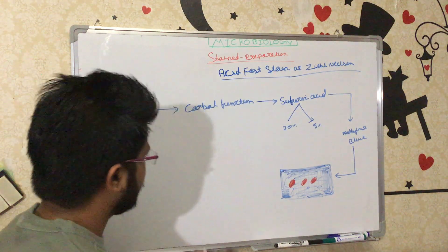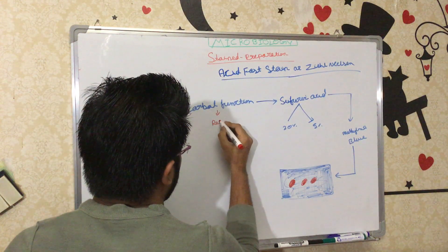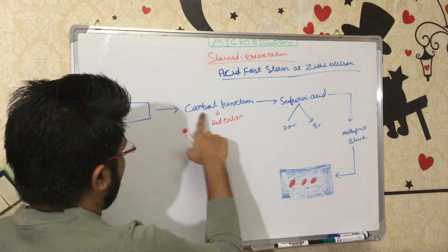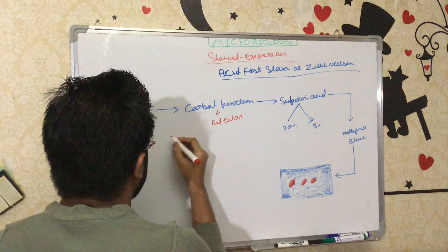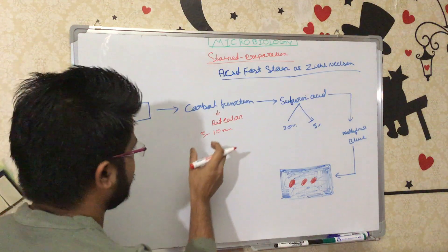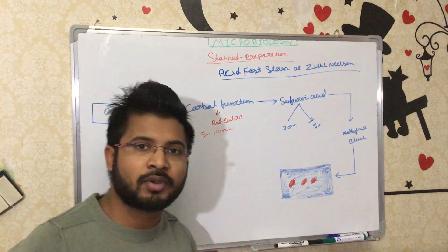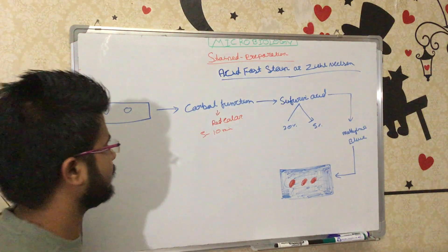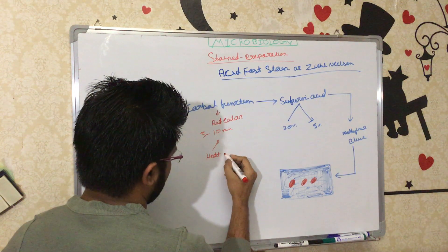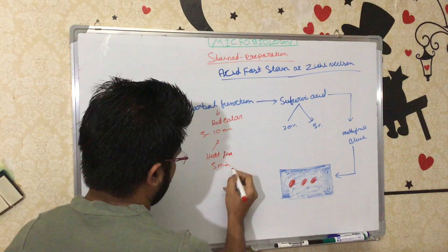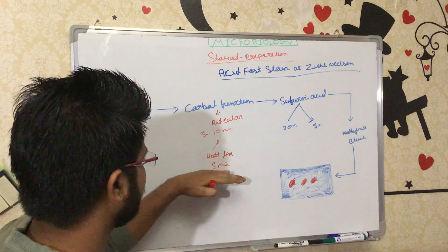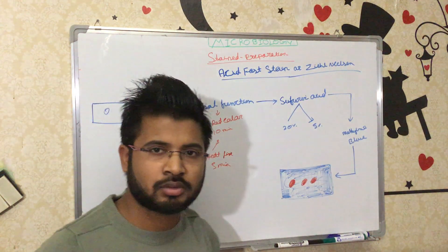After heat fixation, we apply carbol fuchsin — which is a red color dye — on the slide. We apply the carbol fuchsin and wait approximately five to ten minutes. During this time, we also heat-fix the slide for approximately five minutes, allowing the stain to penetrate.